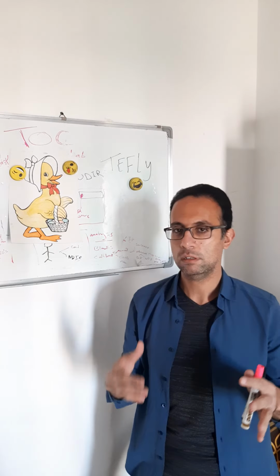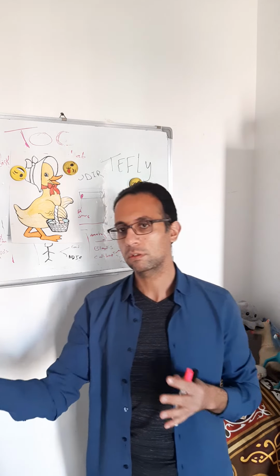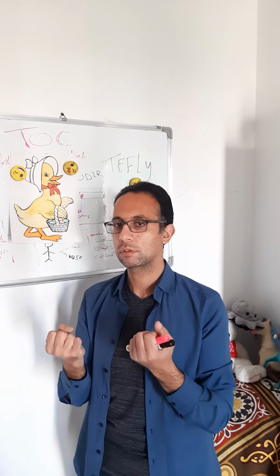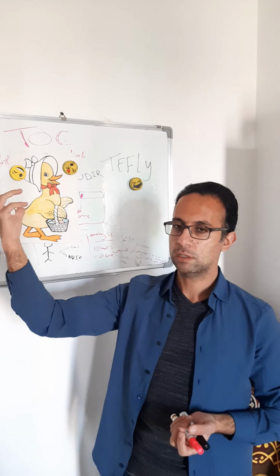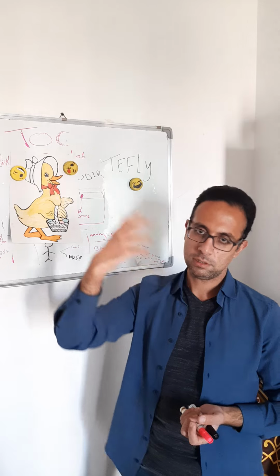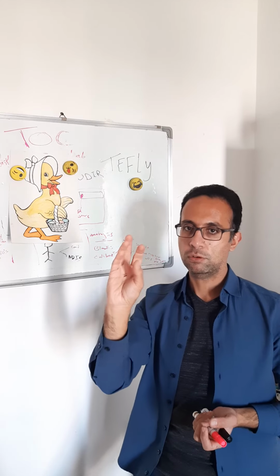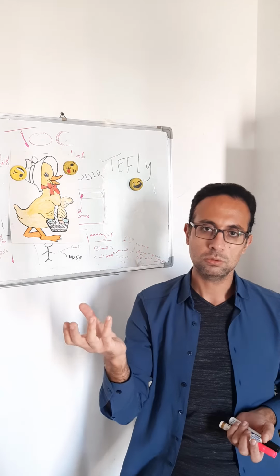Can a TOC analyzer detect by flame? We said in the analysis stage we use UV or combustion. So in detection, the actual measuring of carbon comes through measuring the released CO2. We measure carbon dioxide gas, which represents carbon at the end, of course. So organic carbon, we measure it in the form of CO2. So how can we measure this CO2?